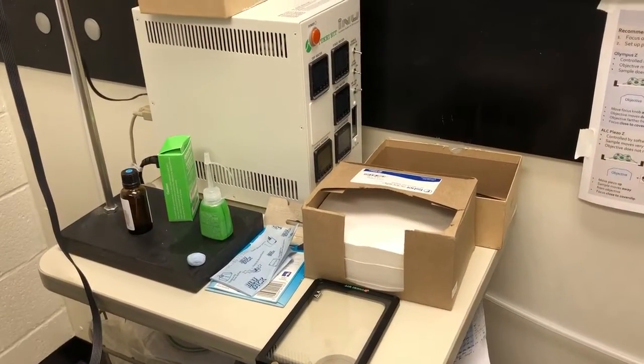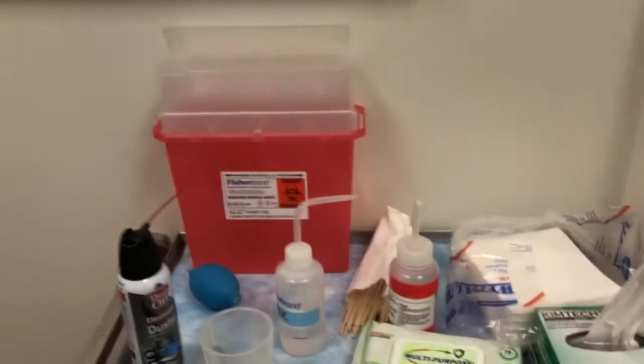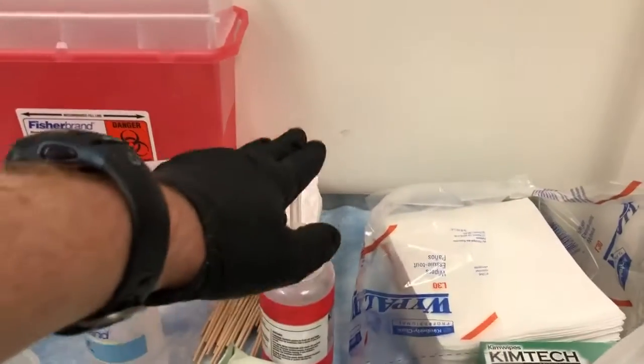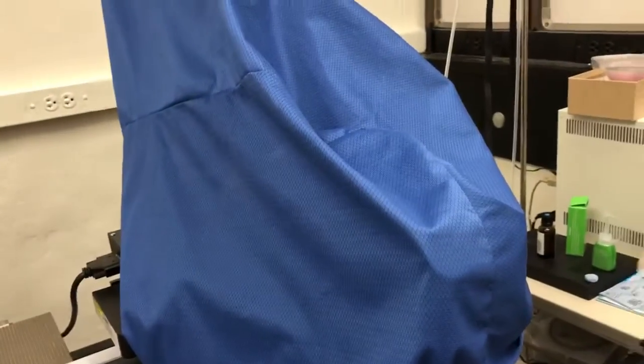The eyepieces you can find here. There is lens paper on the table right next to the microscope, and there are kim wipes over here. This is the 100% ethanol. That is the 70% ethanol. So you have everything you need to properly disinfect the system before starting.